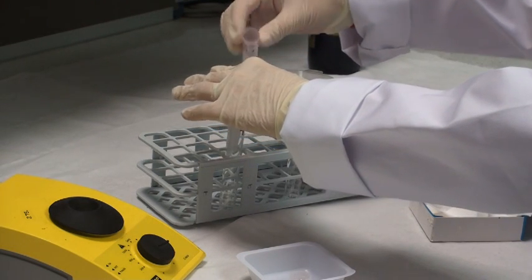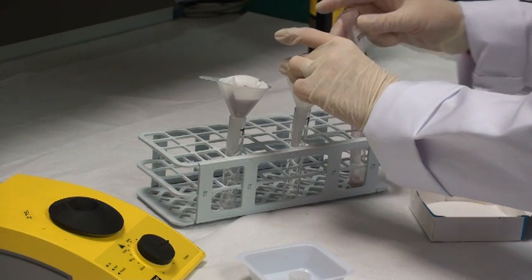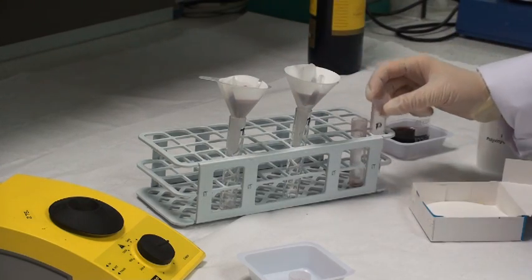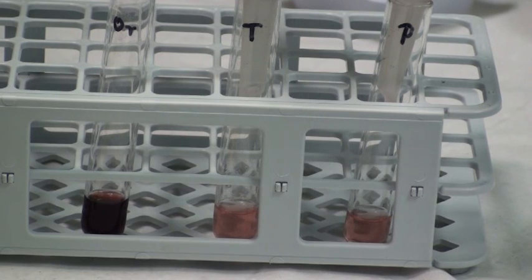This filtration will take approximately 5 minutes. It's not essential to obtain all the sample, but to collect about 1 or 2 mLs would be preferable. In comparing the original wine sample and the samples treated with PVPP in either tablet or powder form, you can see that most of the colour, but not all of the colour, is removed.